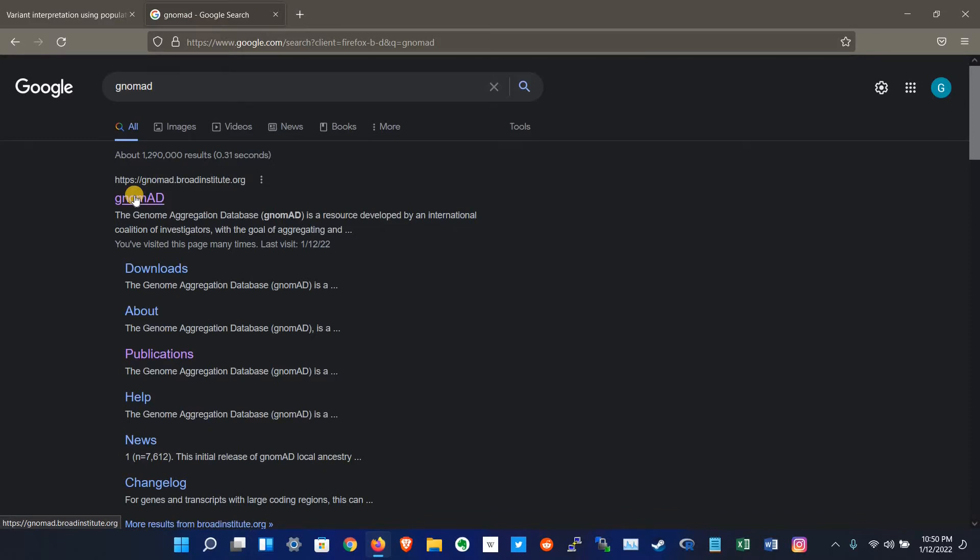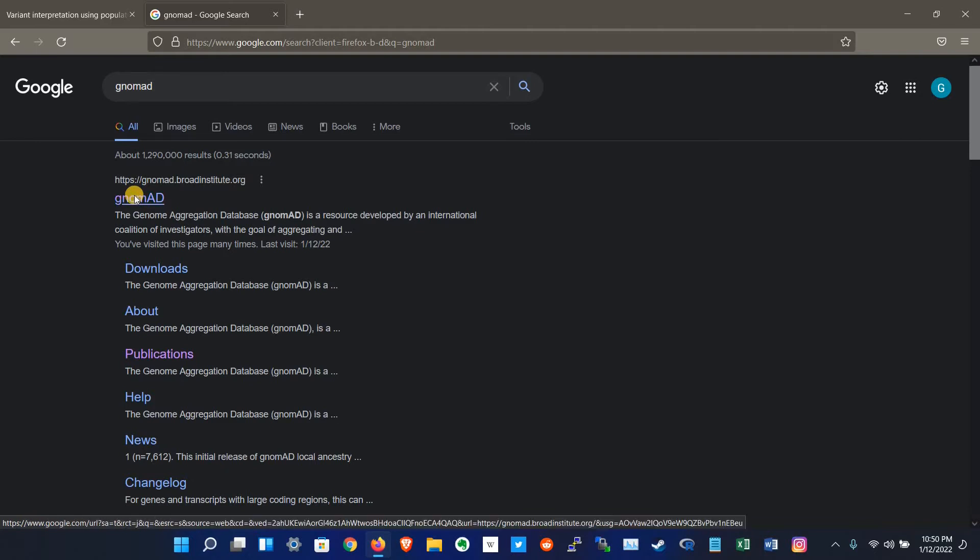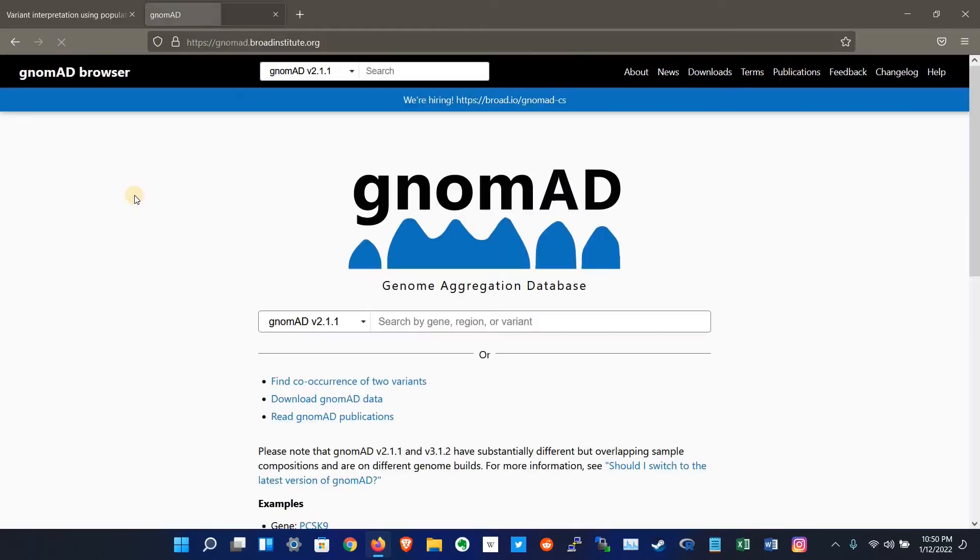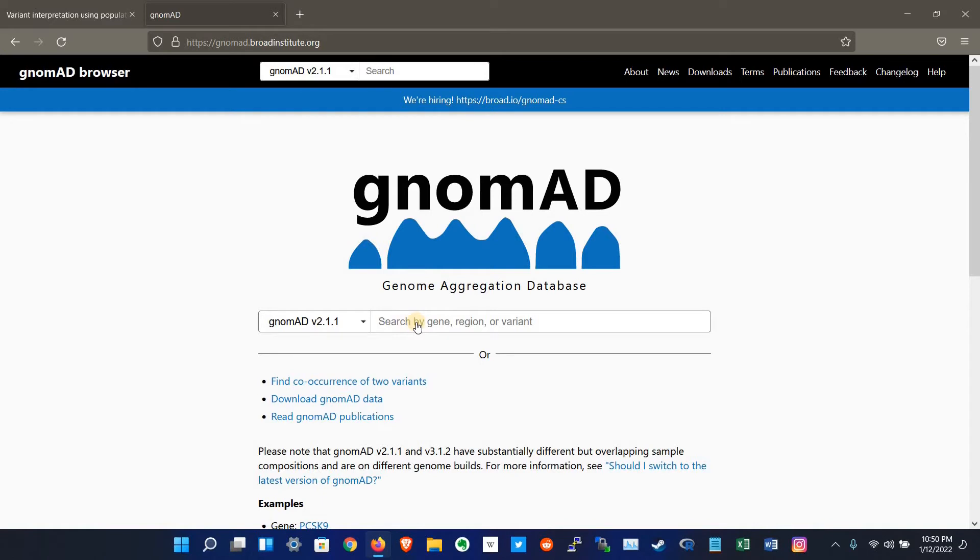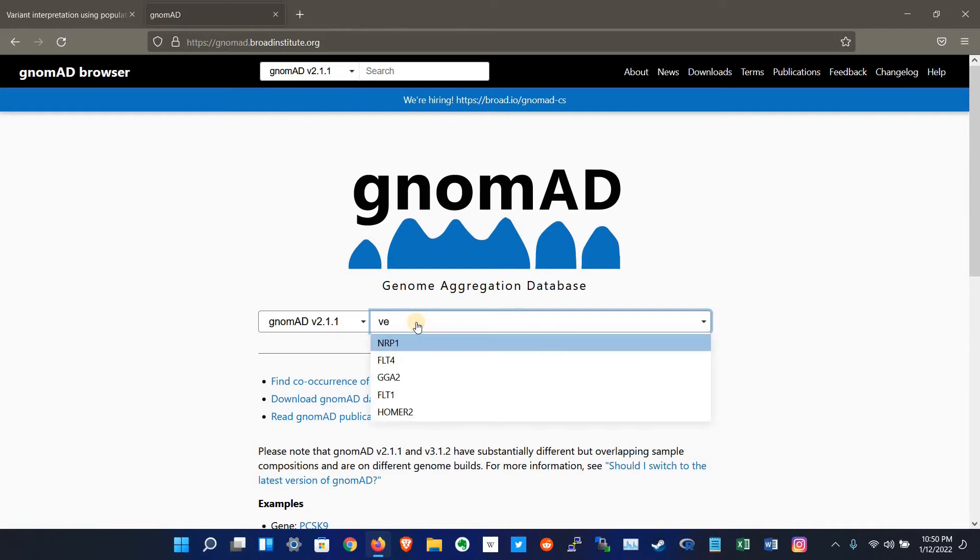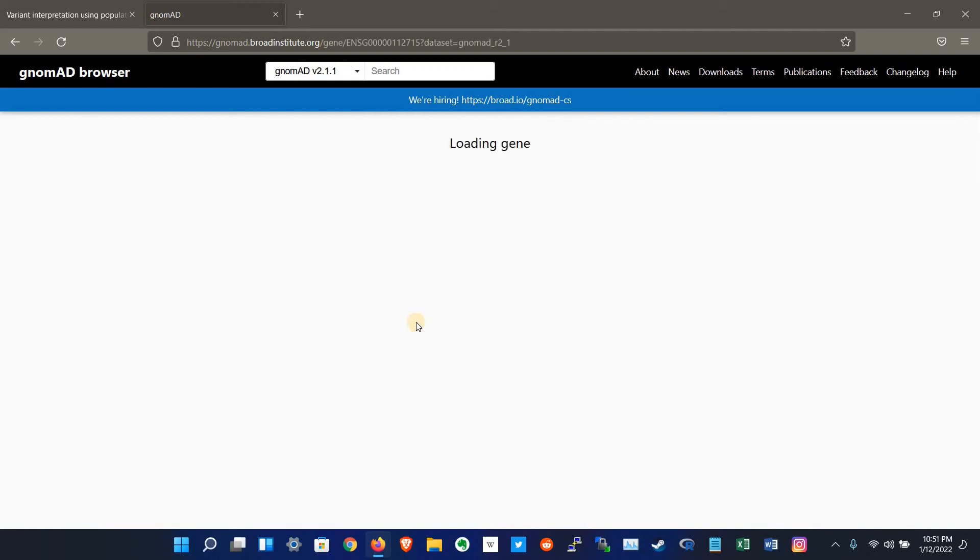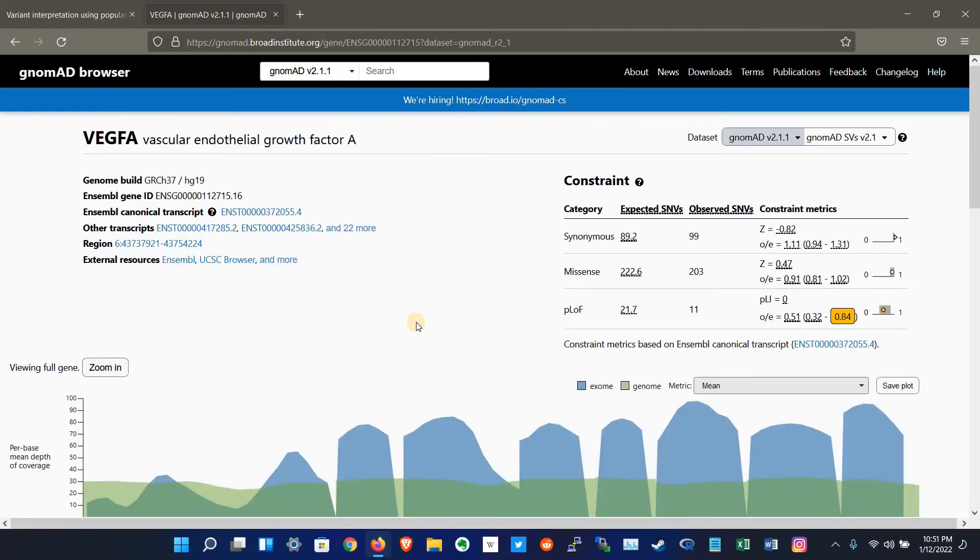This is the main page of the gnomAD website, and here we have to search for our gene of interest, or region, or variant. Here we search for the gene, for example VEGFA. Here you go.